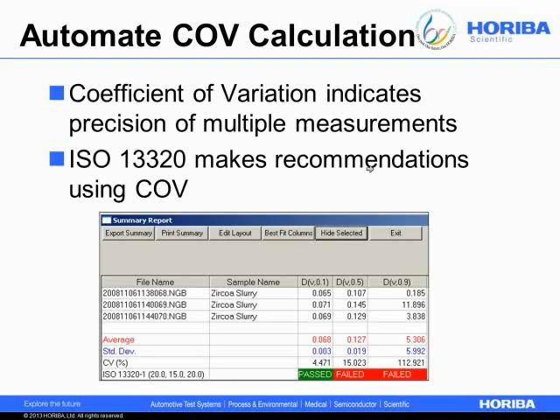Because what's happened is, as you shake it up and down, the finer particles will percolate downwards. So they'll basically bounce in between the larger particles, is the simplest way to think about it. And so you get a lot of segregation by size.